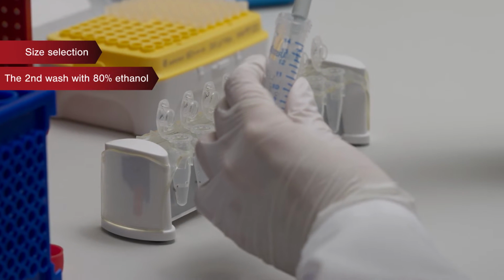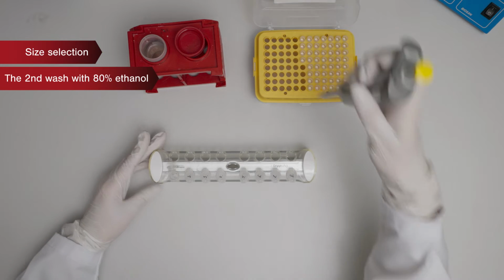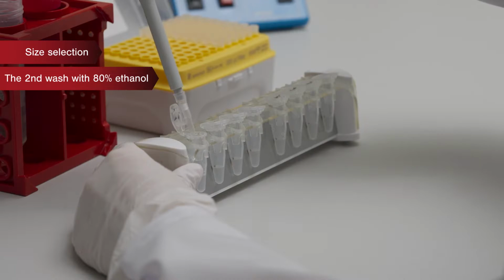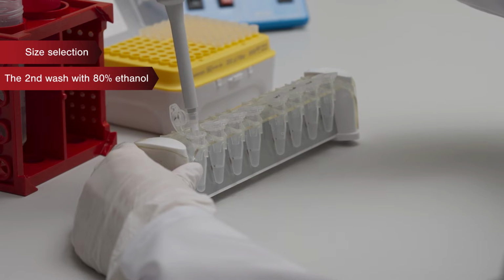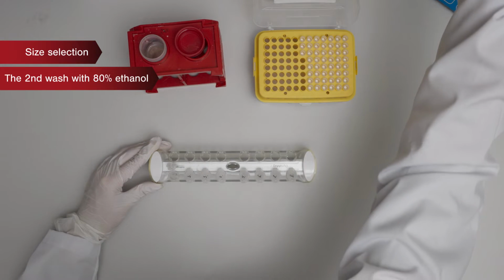When the second washing is done, try to remove all the liquid and air dry the bead with the microcentrifuge lid open. Beads are dry when they no longer appear shiny, but before the bead pellet starts to crack.